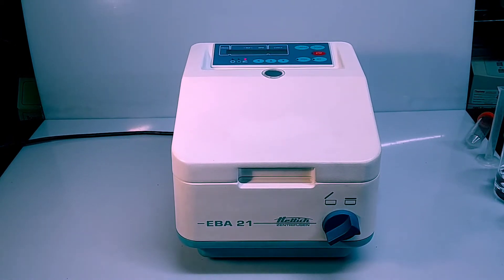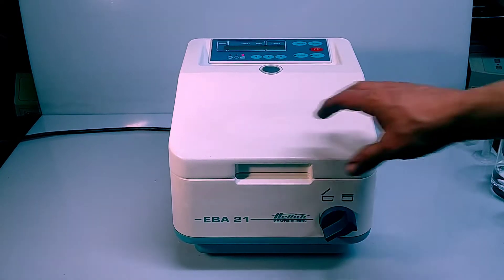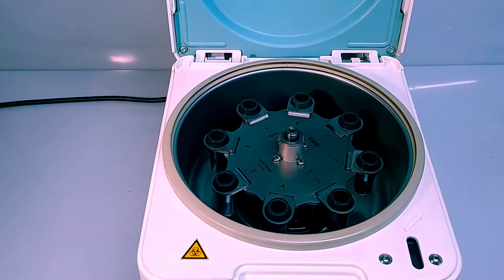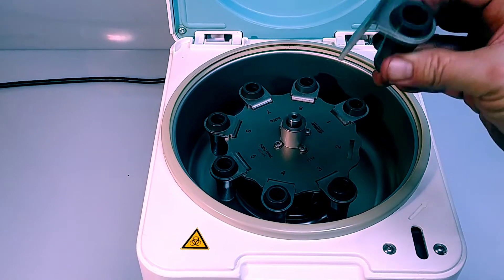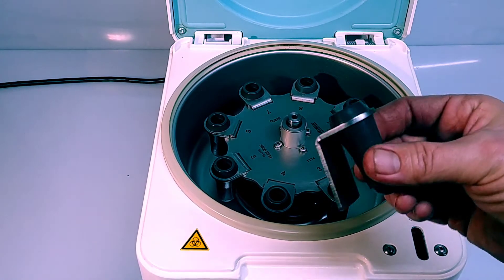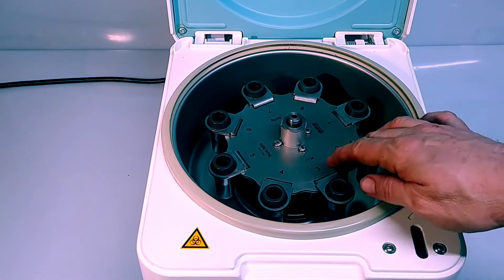Hi everyone, this is a quick video to demonstrate the operation of a Hettich EBA-21 personal centrifuge. They're great little units, very handy. Opening the lid, this unit is configured with a 1114 rotor — it's an eight-position rotor, currently configured with 1127 carriers, which are good for 13 millimeter diameter round-bottom tubes.